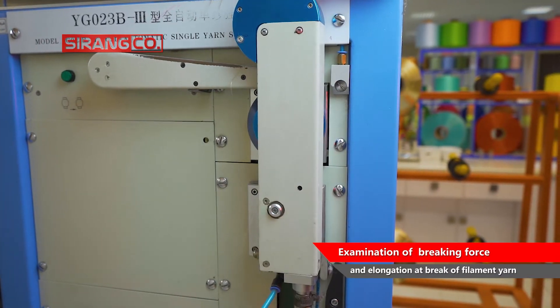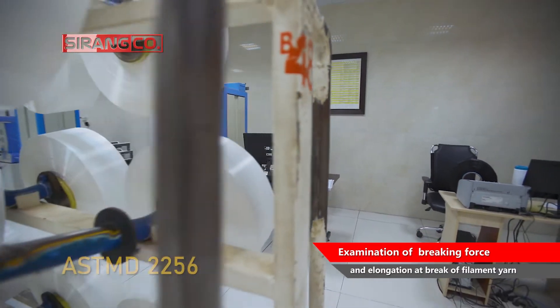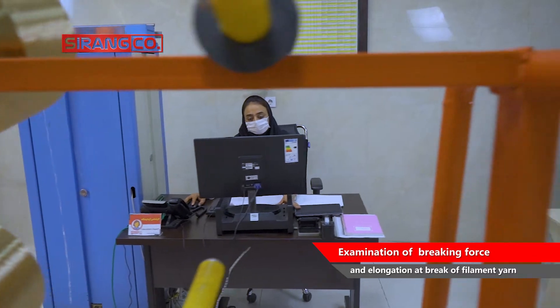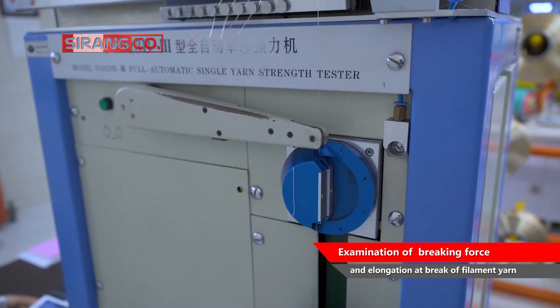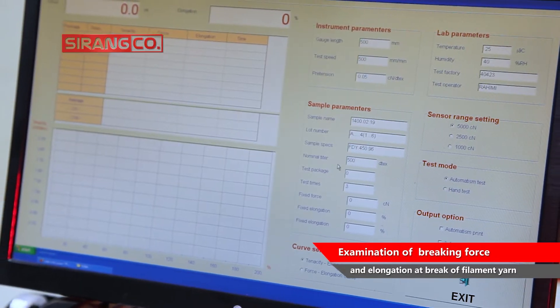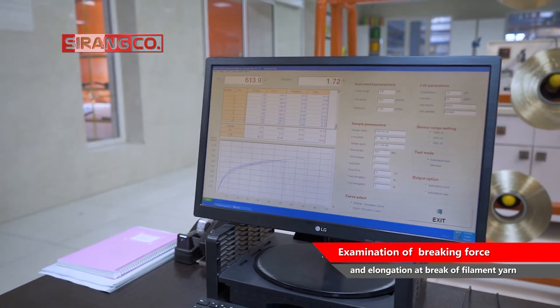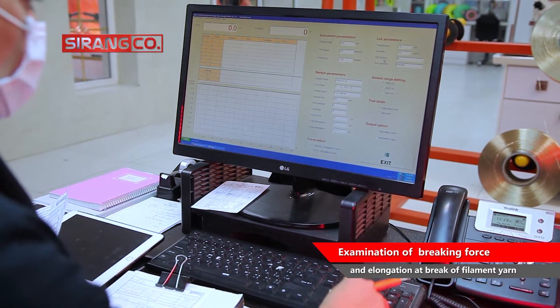A CRE tester can be used to determine the breaking force and elongation at break of the yarn. One end of the yarn is placed in a fixed clamp, and the other end is placed in a clamp that moves at a constant speed. This device is fully automatic, equipped with a system for displaying and recording the breaking force and elongation at break, and is also able to draw a stress-strain diagram that can be used to analyze the elastic and plastic behavior of yarn.